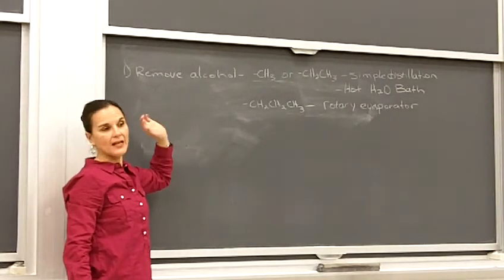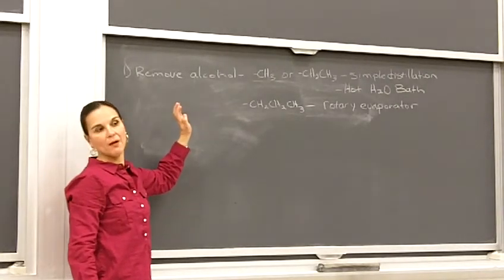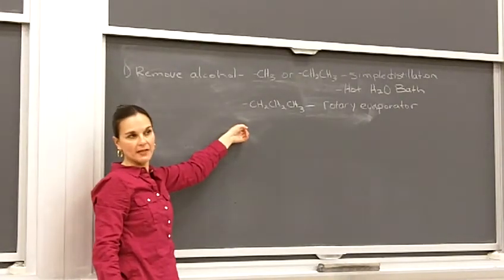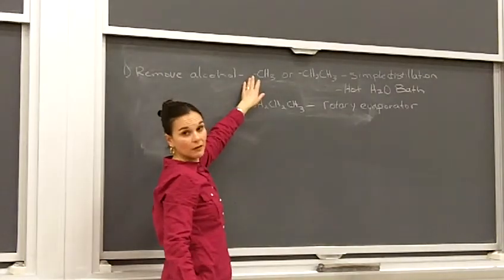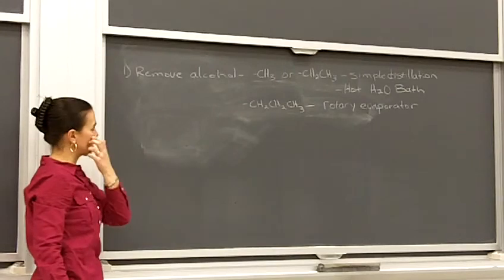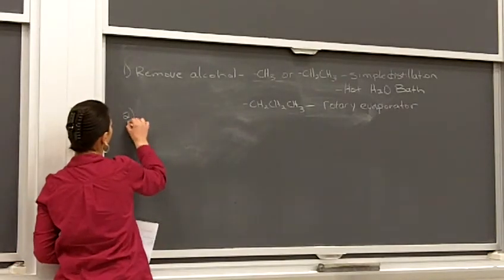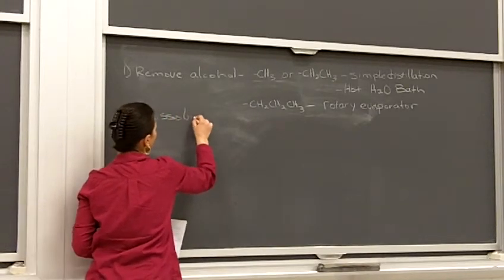So it's not going to save the propanol people any time at all using the rotovap. It's going to take some time even with the rotovap to remove the propanol because it's high enough boiling, okay? So it's not like you guys are getting the short end of the deal with the methanol or ethanol, all right? So simple distillation, we're going to remove the alcohol. Then we need to dissolve the residue in ether.